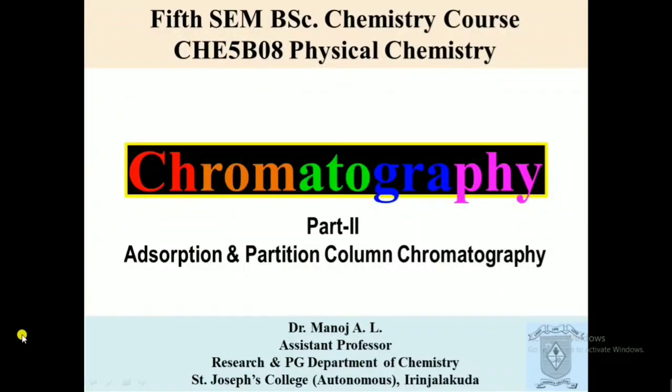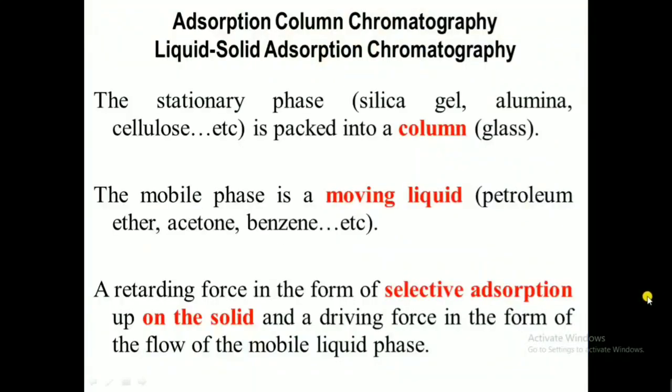In this lecture, we'll discuss column chromatography. There are two kinds of column chromatography. One is adsorption, and the second one is partition column chromatography. So first, we will see what is adsorption column chromatography.